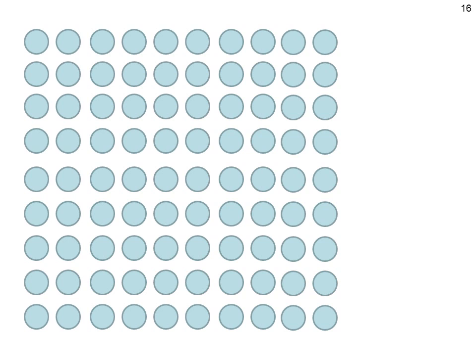This is not unusual, for example, for a somewhat medium-sized peptide. Out of 100, there's a chance that one of these 100 is carbon-13, because we have 1.1% of carbon-13 in nature. This is, however, a completely stochastic random process. I cannot tell which of these 100 is carbon-13, but there is a high statistical probability that one is.